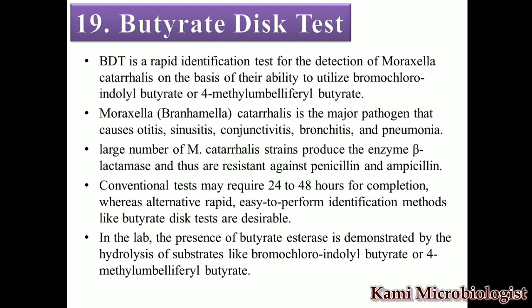So if we compare the conventional test with the butyrate disk test, this one is very rapid, easy to perform, and the best test for the identification of Moraxella catarrhalis.